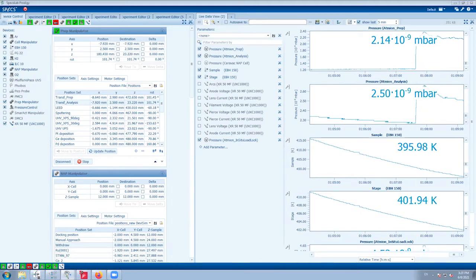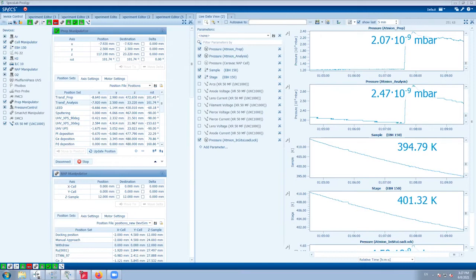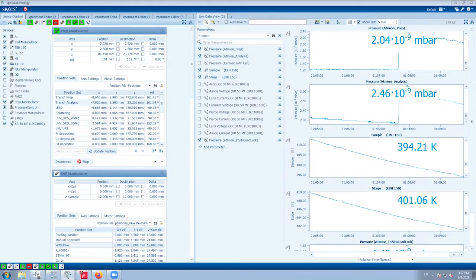But I would like to use this time and answer Andre's question of how you prepare the powder samples. There are several ways, and it also depends on whether you want to heat up the sample or not. If you want to do just pure analysis, either in ultra high vacuum or in water or other liquid pressures at room temperature, you can simply press the sample into indium foil. That works quite well for most of the powder samples we deal with.